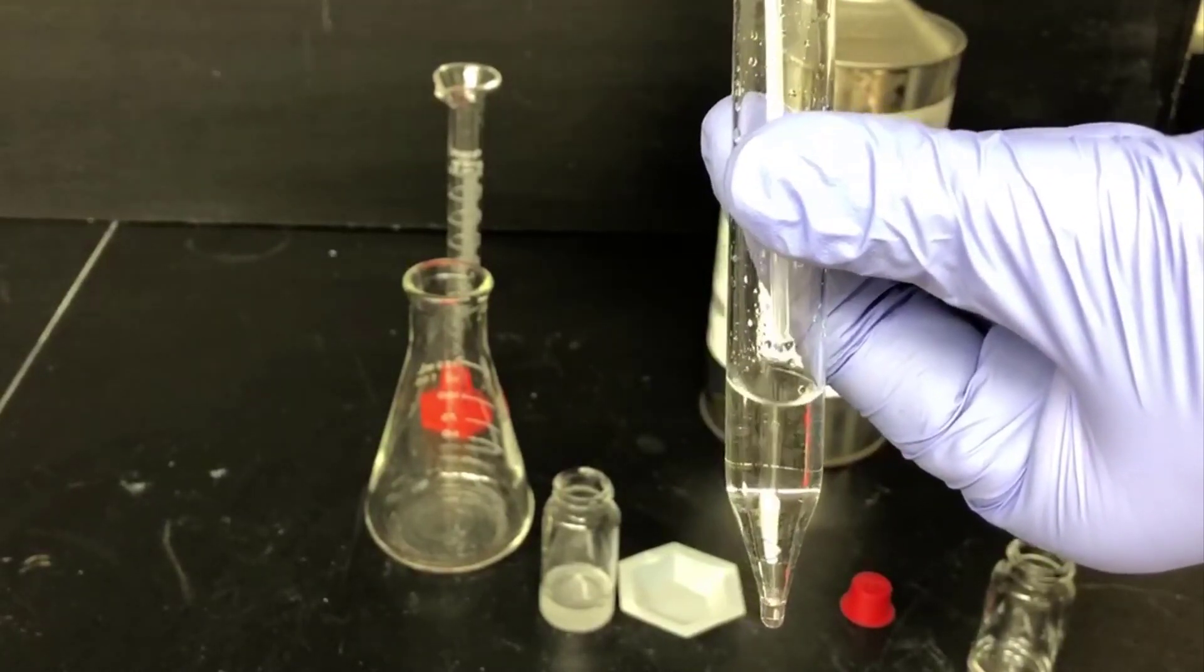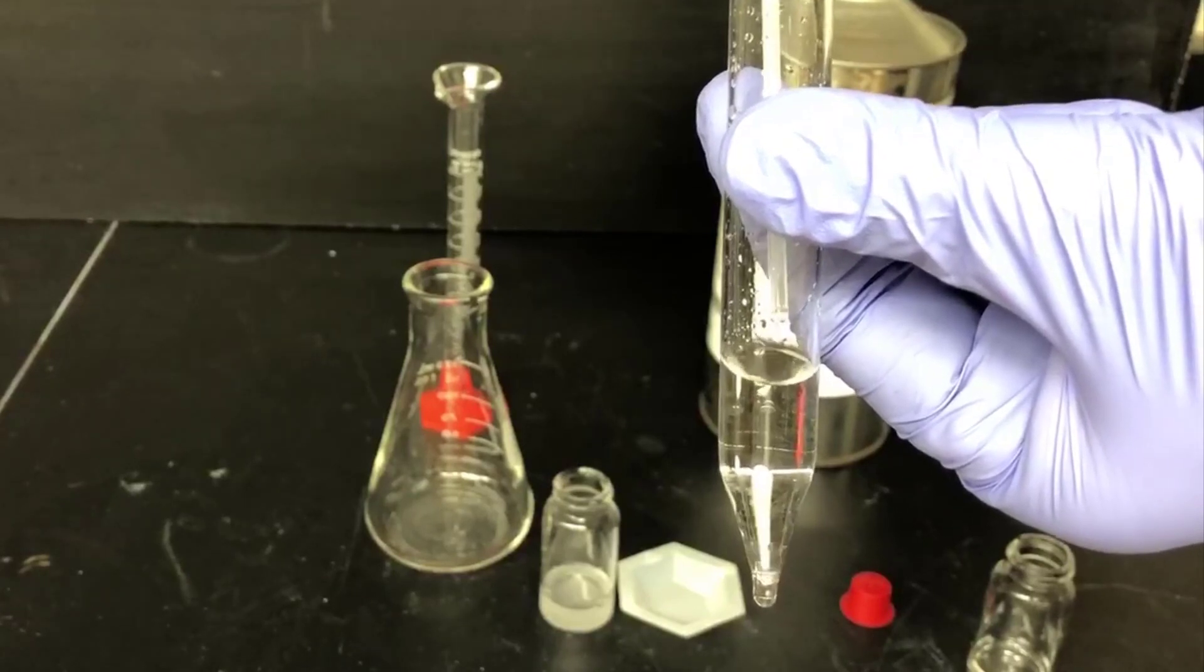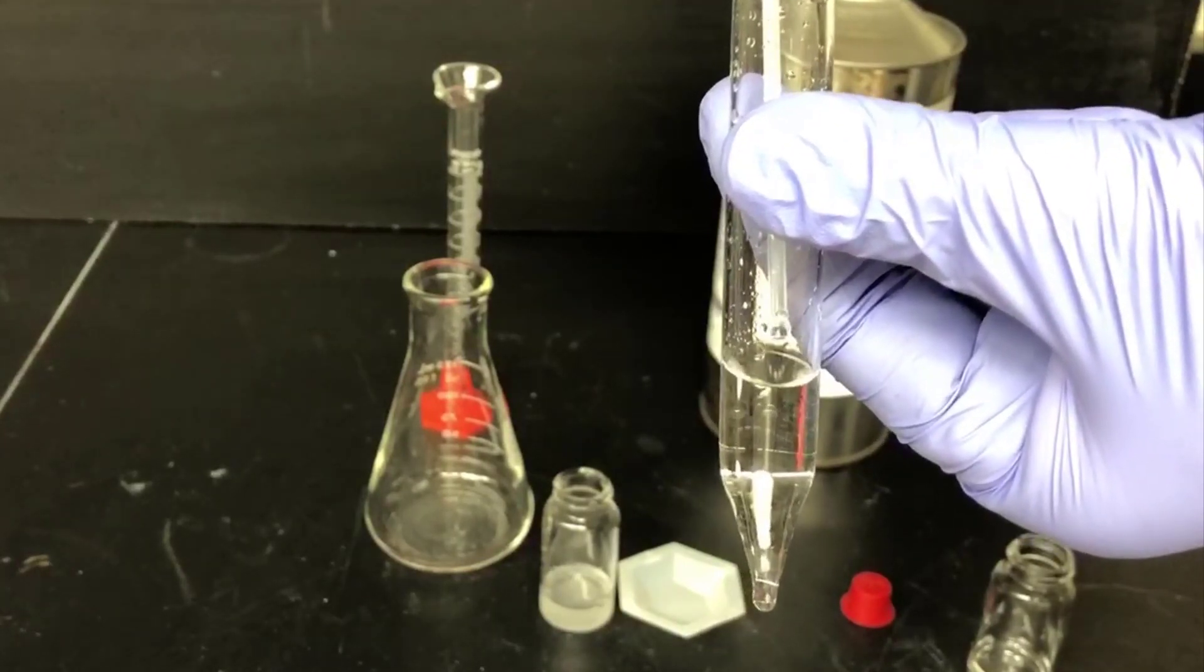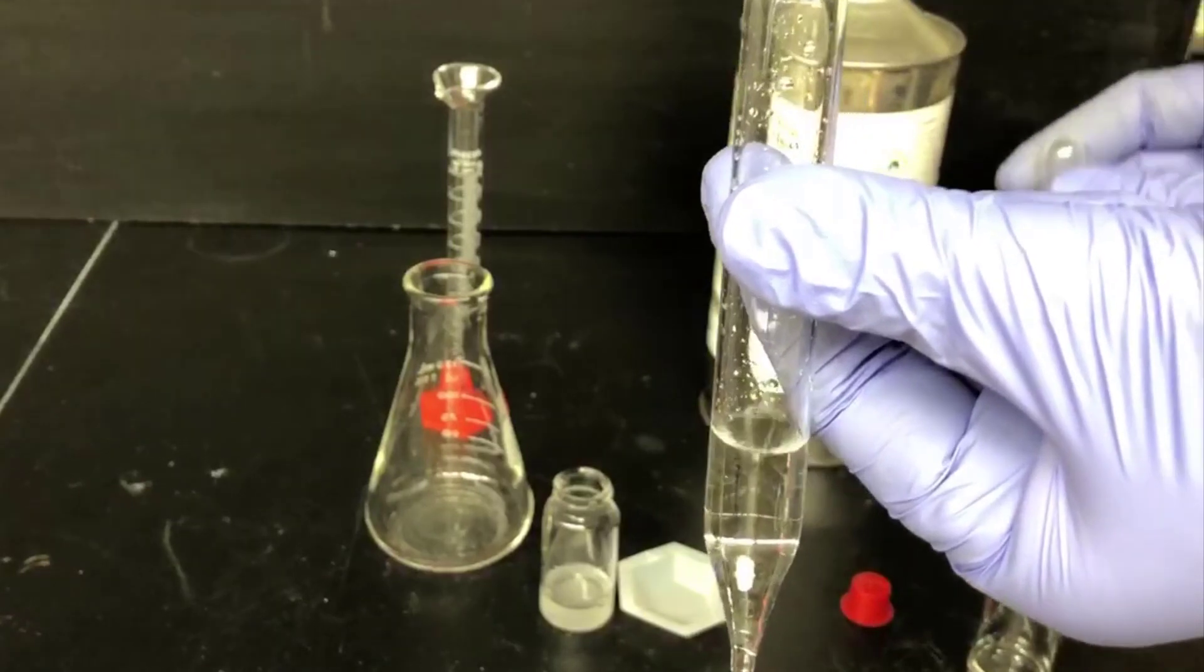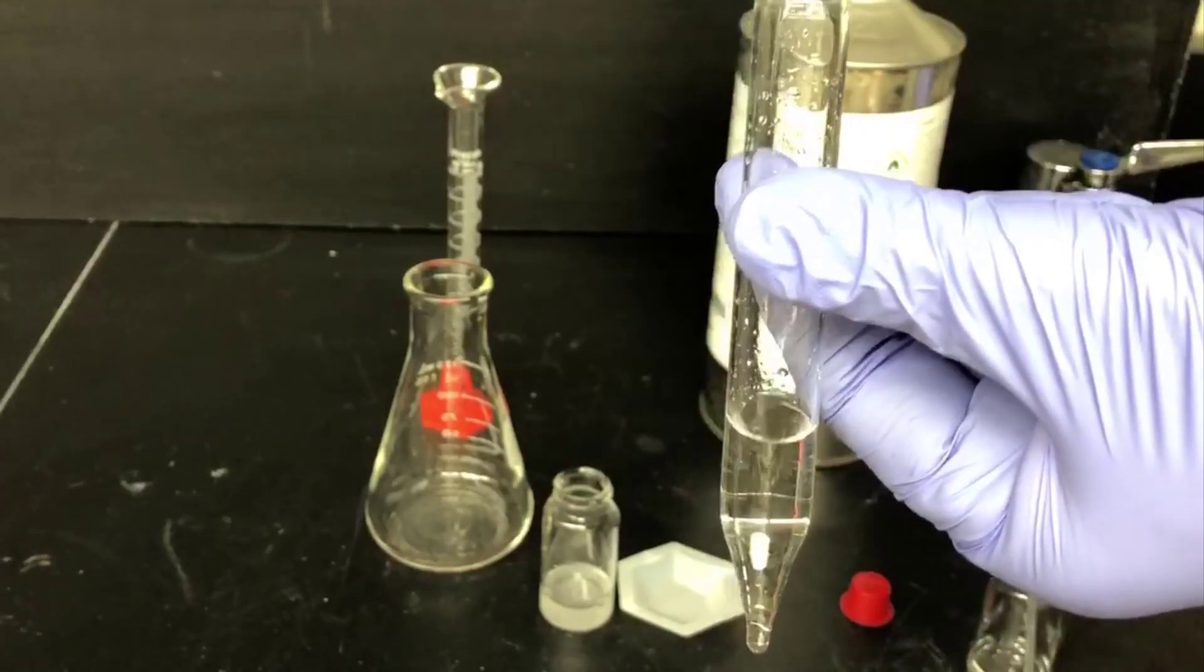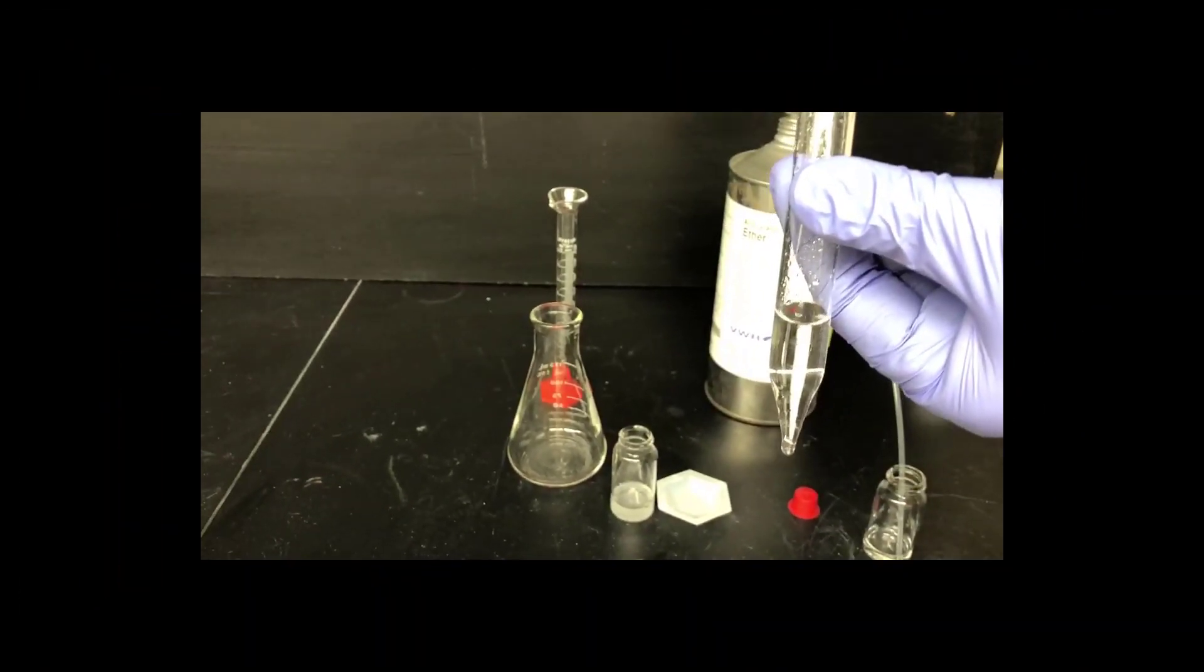If you watch carefully, you'll notice the water droplets are sinking through this layer and forming a new layer on the bottom. This indicates that the layer in the pointed test tube must be the organic layer. That's where the cyclohexanone is because it's more soluble in ether than it is in water.